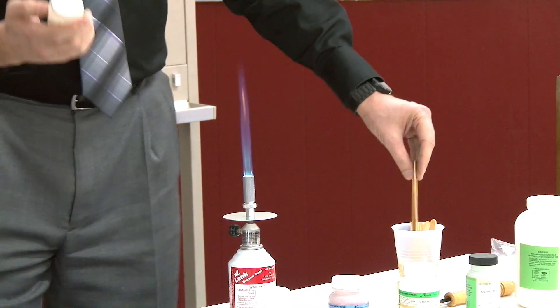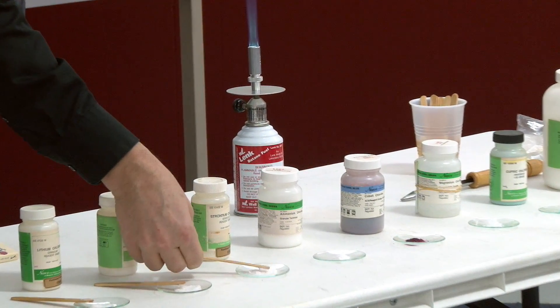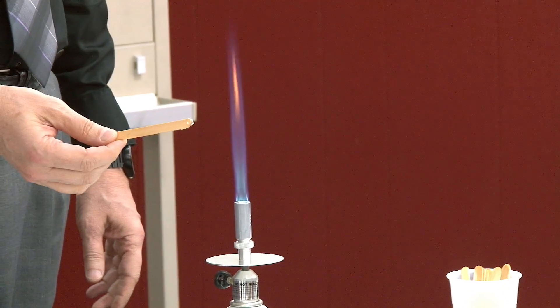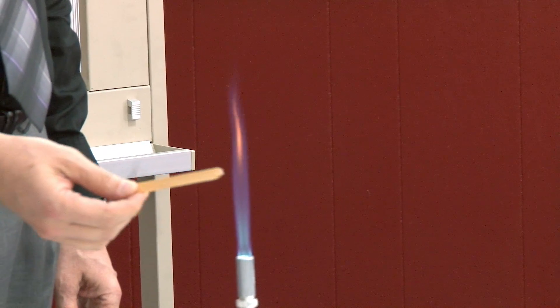This one is strontium. As you can see, all these powders are white — white or clear. This is strontium — orange. Orange.